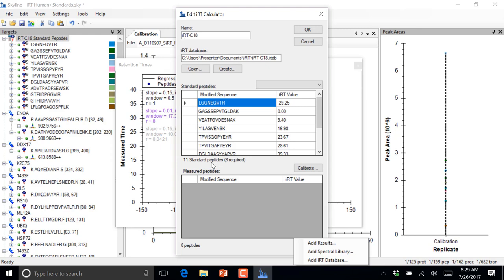It's actually the median. It's a median time point. But yes, it's a spectrum. It's a spectrum time and not a peak time. And so, you know, I guess if you happen to get either side of a peak, then the median time will end up being pretty good.